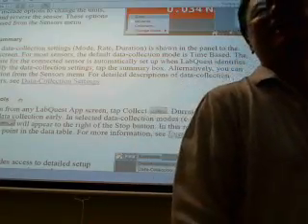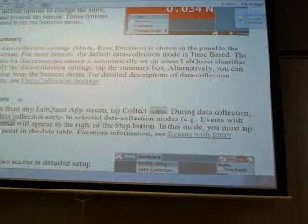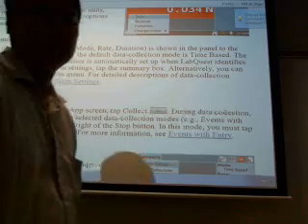All right. Who needs help? So for the actual data recording, we're going to do 60 seconds.